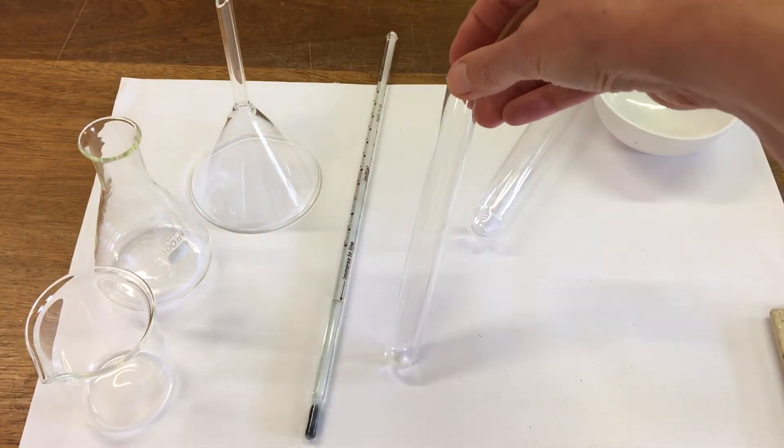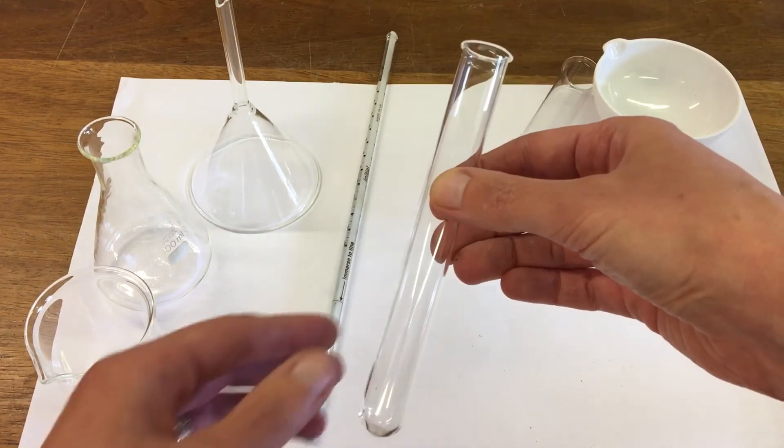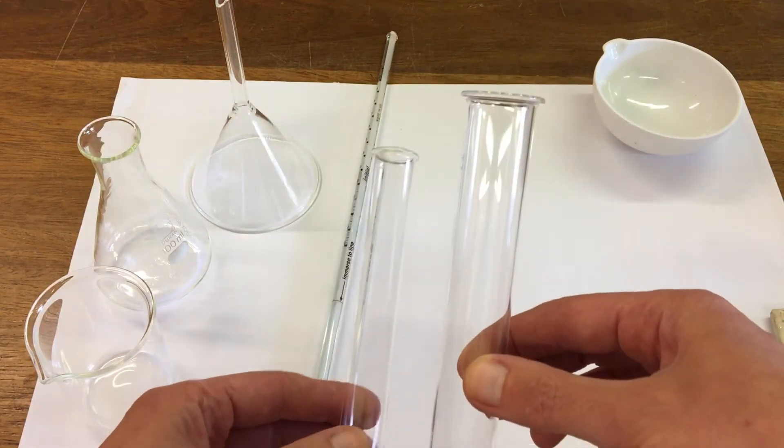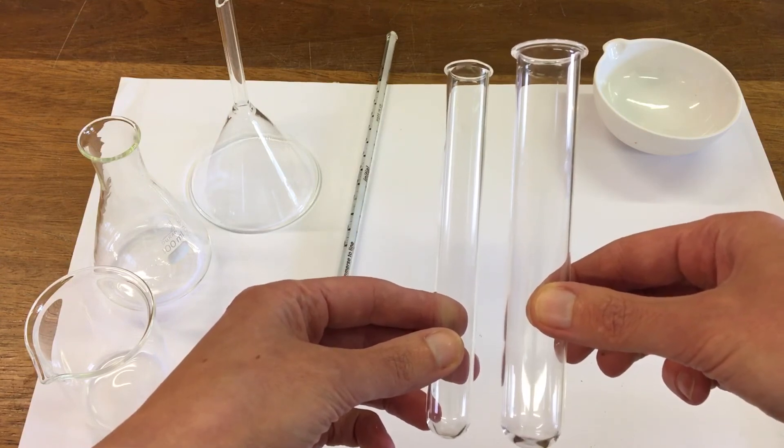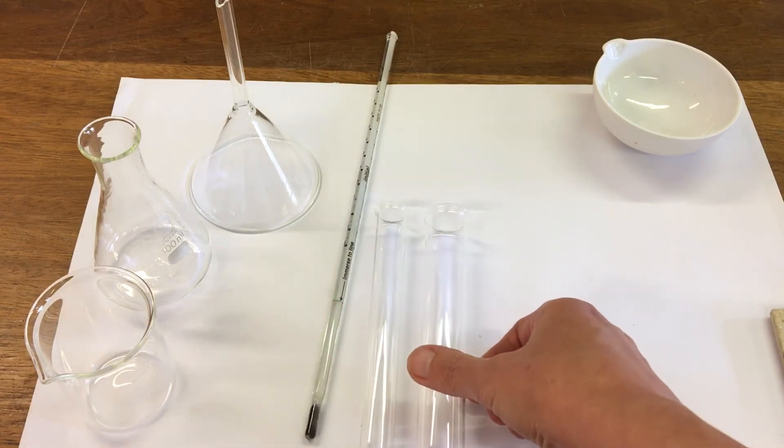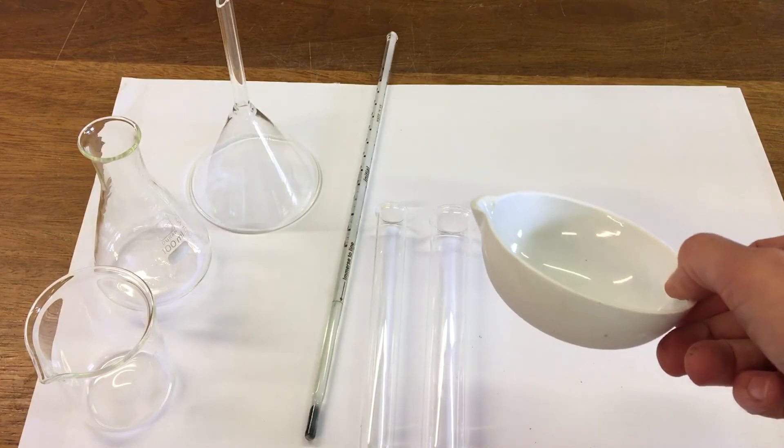This one is a test tube and this one is a boiling tube. So the boiling tube is slightly bigger than the test tube. And this one is an evaporating basin.